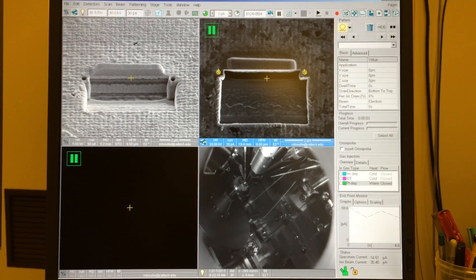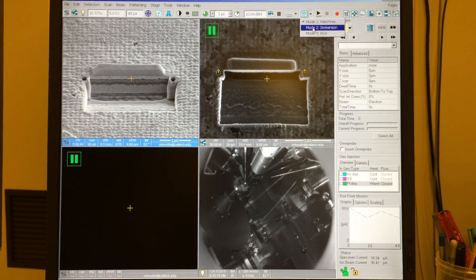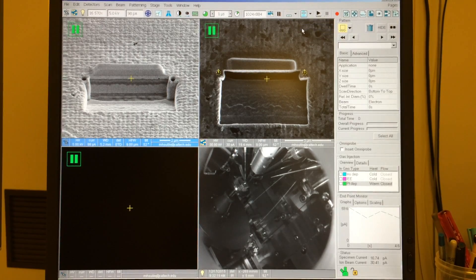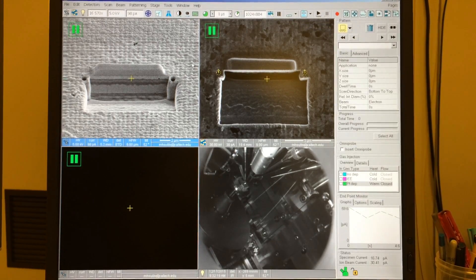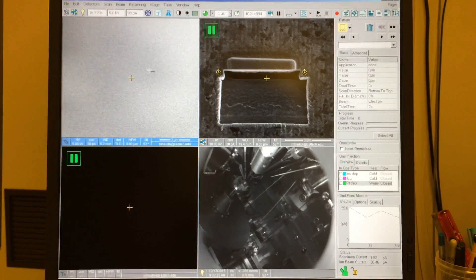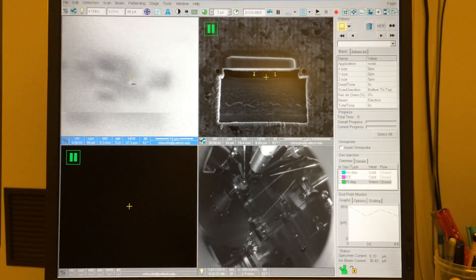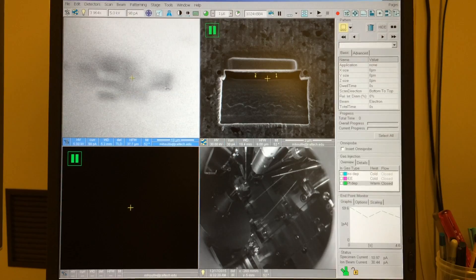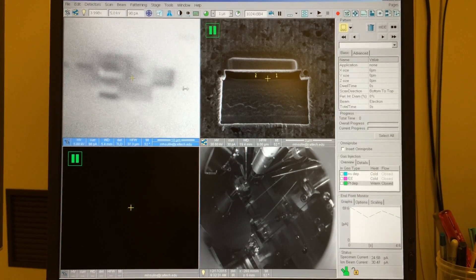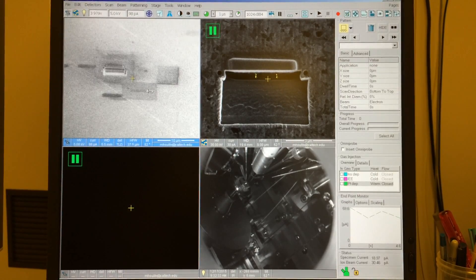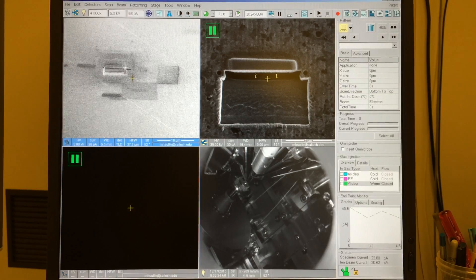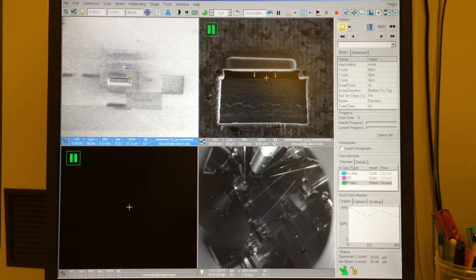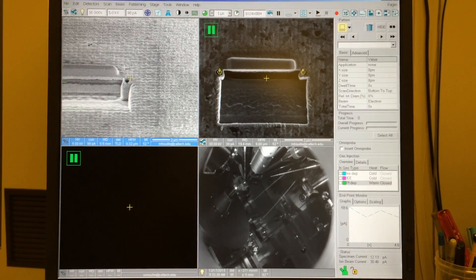So I'm going to jump right into immersion mode, mode 2. And the first thing that I want to do is just adjust the focus so that I can get a reasonable look at my site. Here it is. I'll double-click and zoom in.